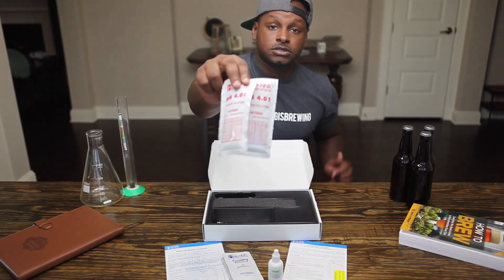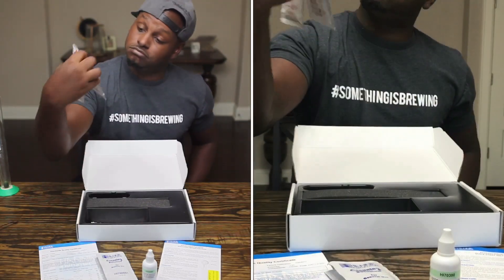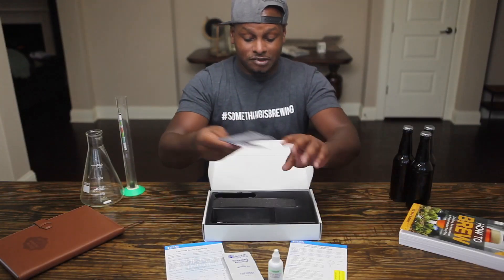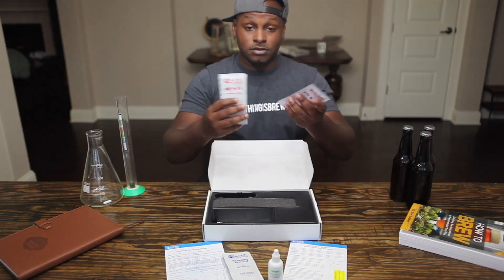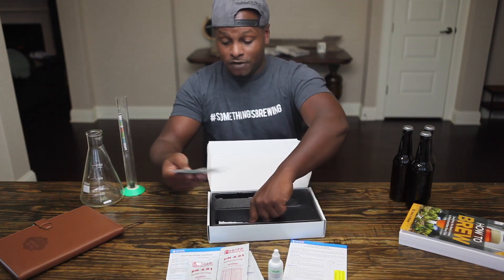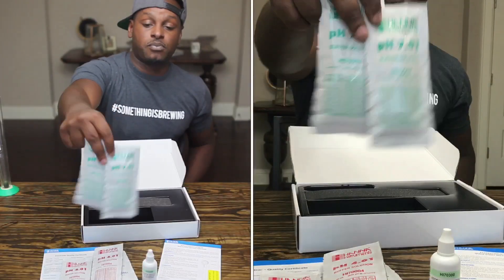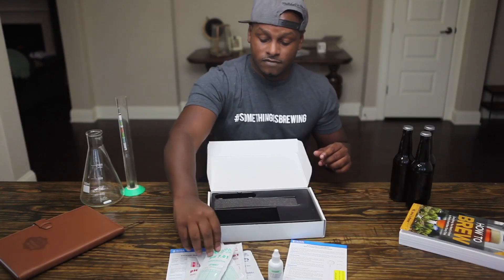It also comes with buffer solutions in case the product ever loses calibration. And they're not stingy with it. Those of you who know other pH meters know they usually only give you the powder form and maybe one sample. You end up on Amazon searching for more. But this comes with solutions all the way down to the 7.01 range — still not stingy, two packs. You're never going to run short.